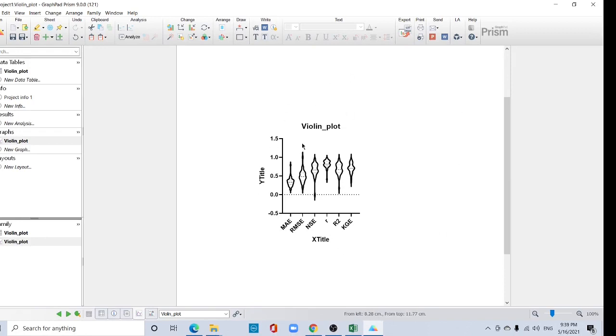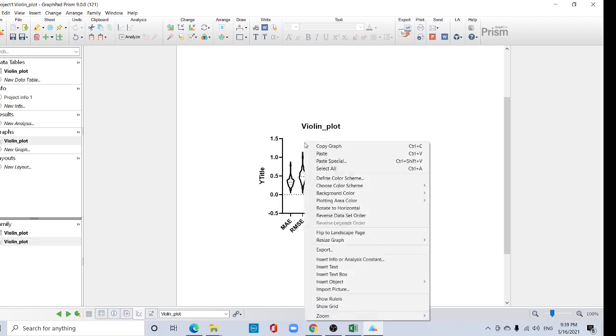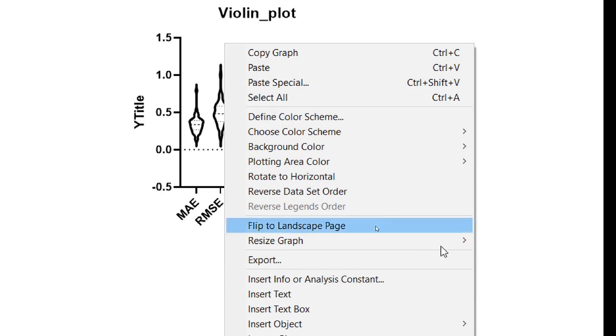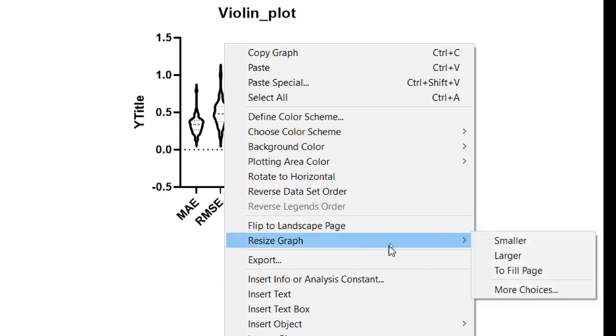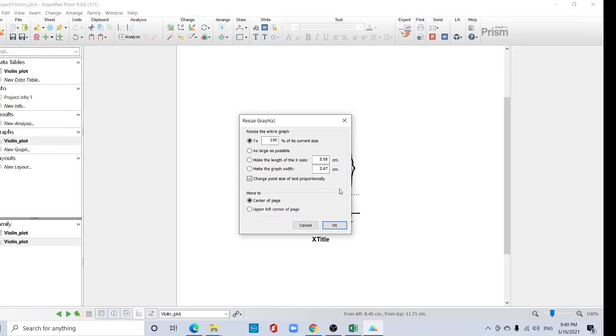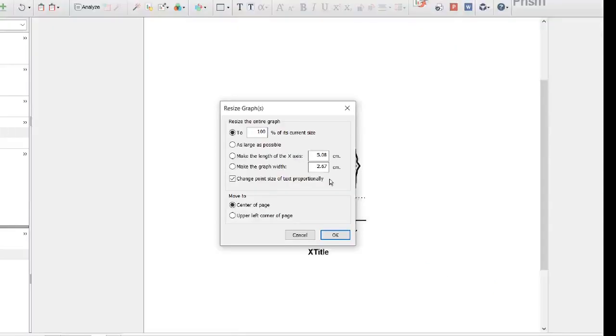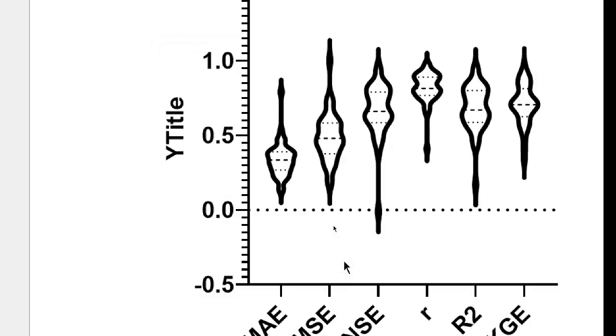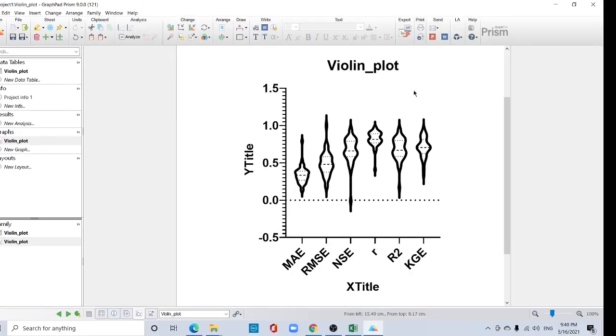Now if you have to do lots of change in this violin plot, the first change is your size. Right click here and resize graph. Right click and resize graph. And here you can find more choice. Click it. You can change by typing here centimeter or you can change by typing here percentage. Okay. Okay, see the size of the violin graph is increased.